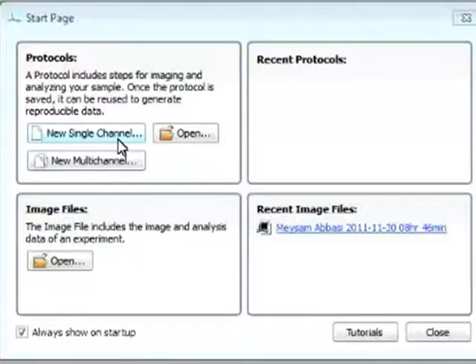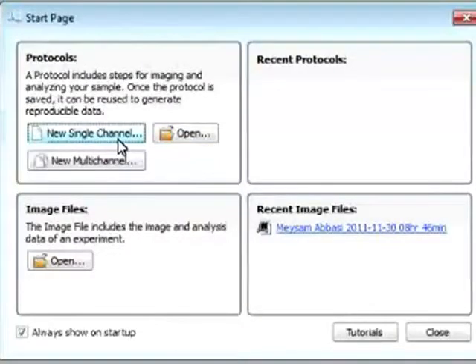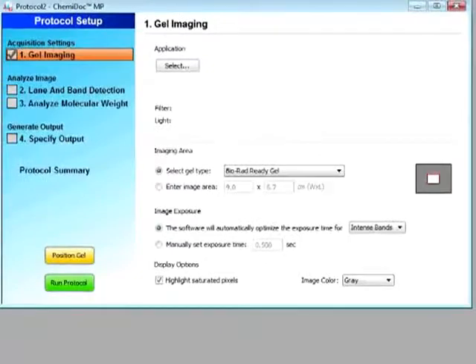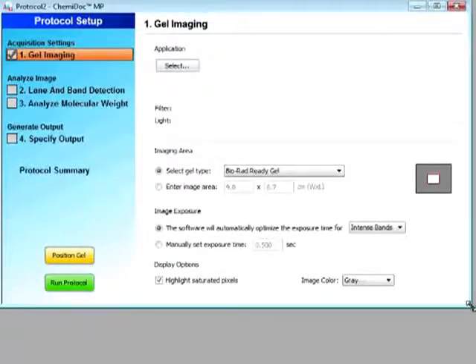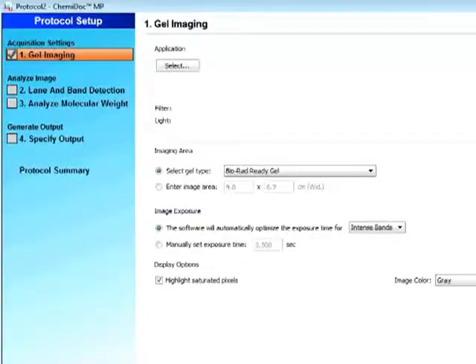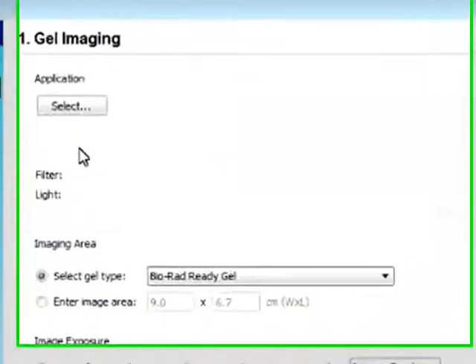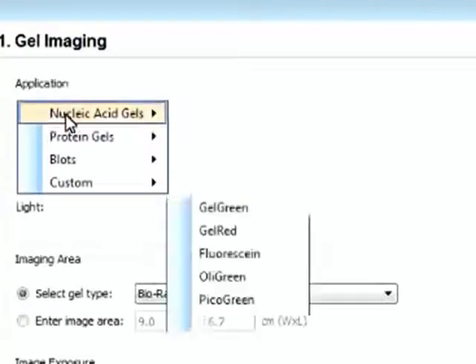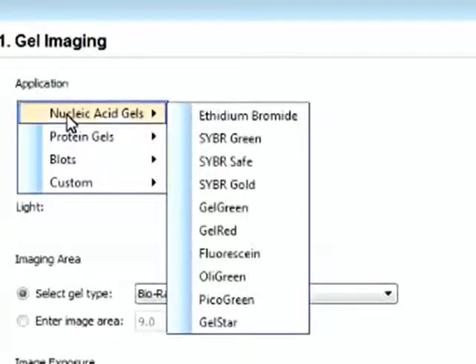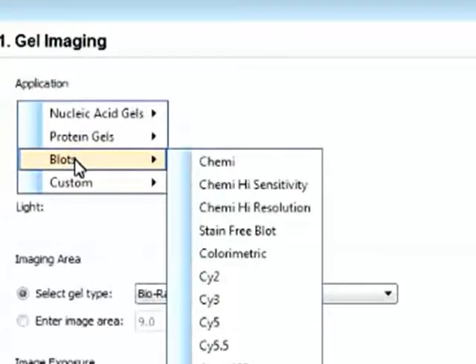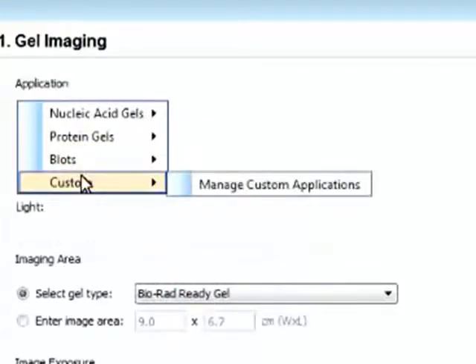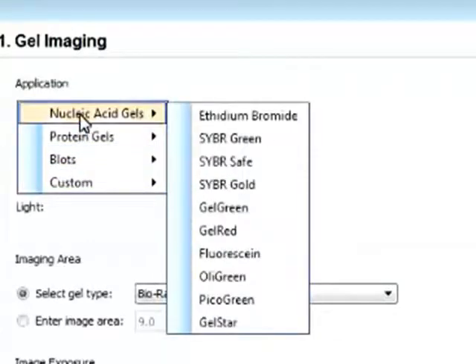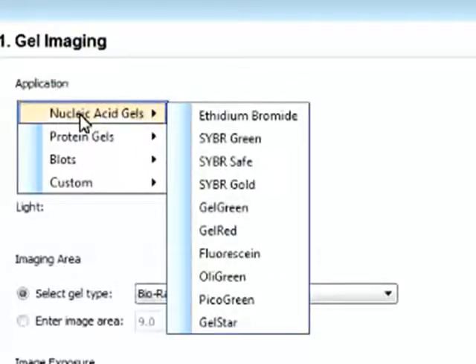So say if you want to start by looking at a new single channel protocol, a nice feature about this software and the whole system is that everything is automated, so the workflow is automated. We basically select our application, whether it's a nucleic acid gel, protein gel, blots, or a custom gel. We select our application, and the light source and the filter will be selected automatically.